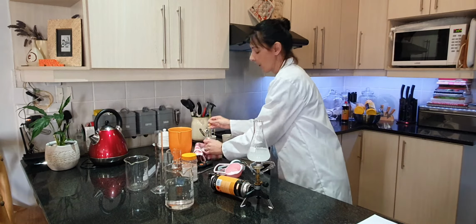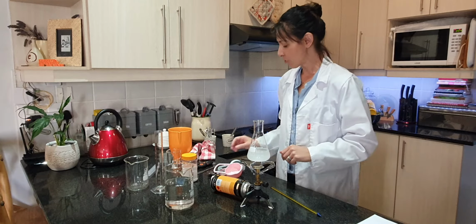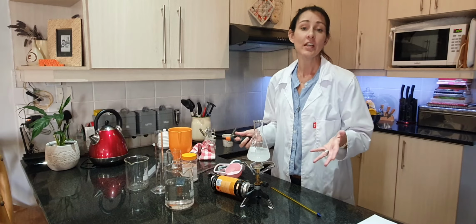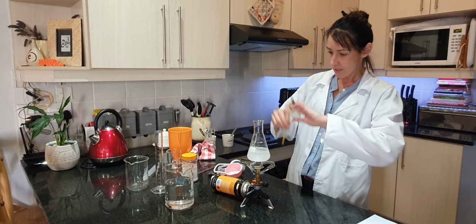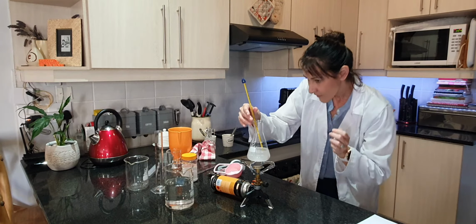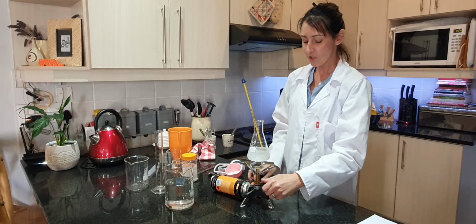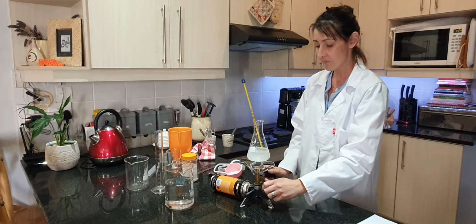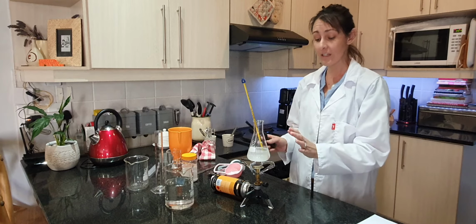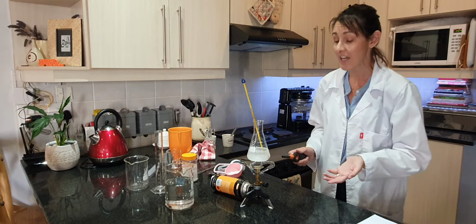So we know what the starting temperature is. It's around about 21 degrees, pretty close to our previous one that was just water. That one was 20 degrees. And let's just double check again. And this one is still 21 degrees. Yeah, so I'm going to switch on my gas burner now. And then we're going to go through the same process and see whether this substance starts to boil quicker or if it's going to take longer.